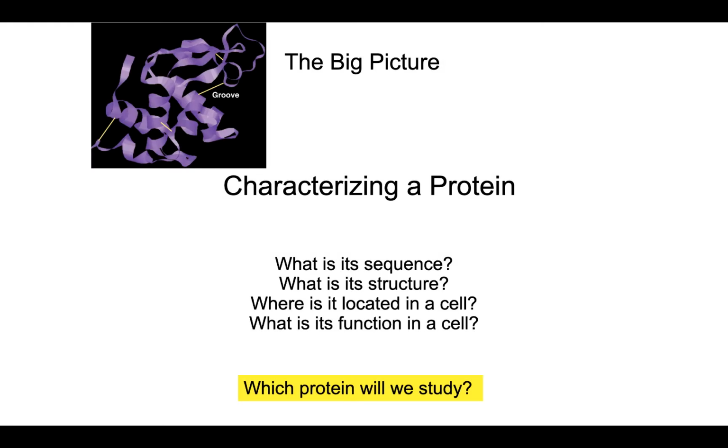All right, in this video, we are going to talk about the experiment that you'll be doing in lab regarding invertase. And so the big picture here is that you're going to be characterizing a protein. What protein are you interested in? Like we just said, invertase. And when you are studying a protein, there's all sorts of questions that you can ask.